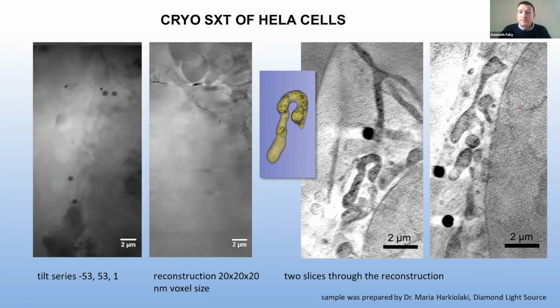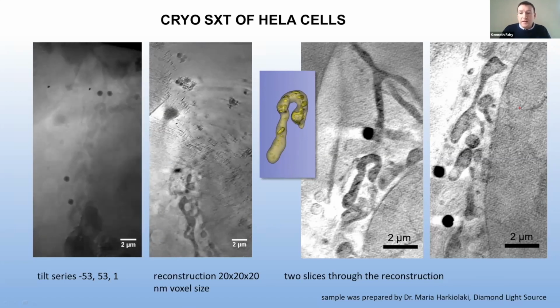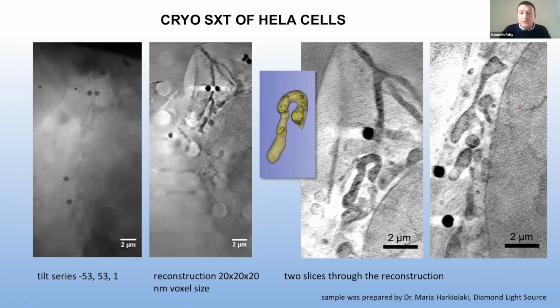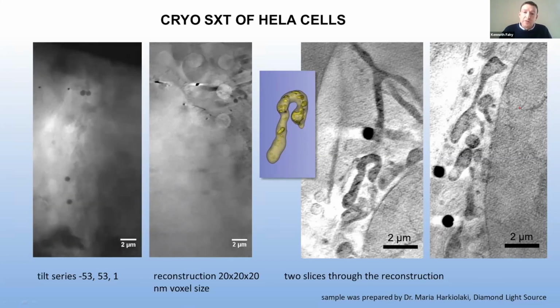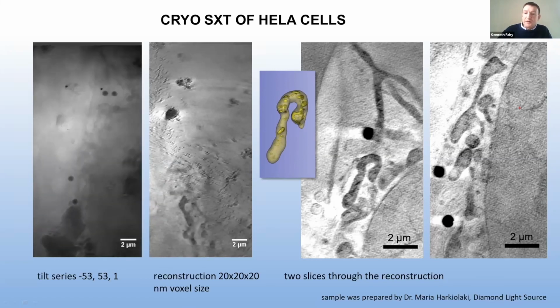and this has allowed us to make a rough segmentation of the mitochondria. Although these use cases have shown only mammalian cells, we can also image bacteria and yeast cells too. So we're open and very interested in ideas you may have in terms of more applications of the technique.